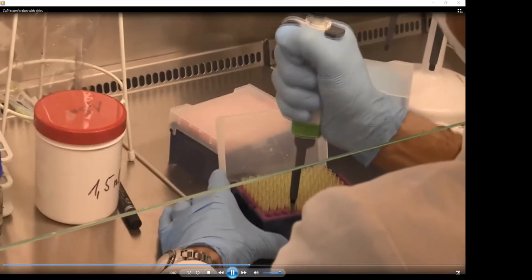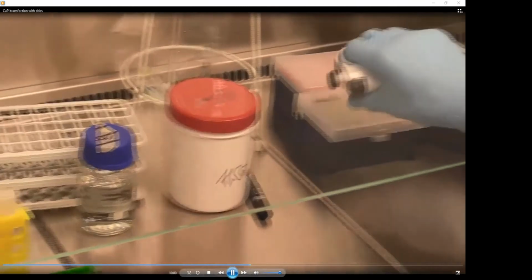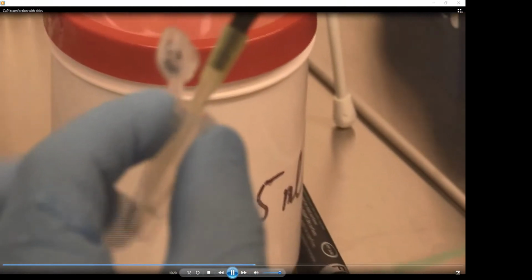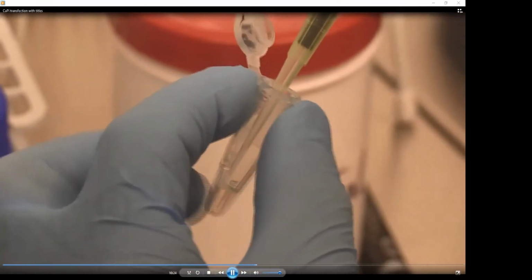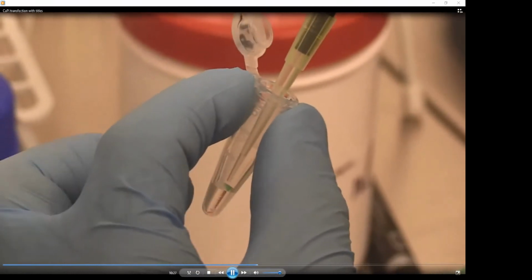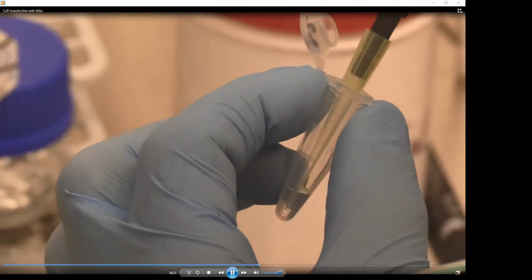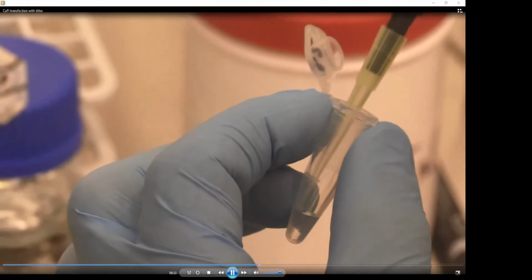Be careful, the volume of the calcium chloride depends on the amount of DNA. So in this case, we have a lower amount of DNA. That's the reason why we are using less calcium chloride, not as in the first sample. Once again, it has to be added dropwise, mixed after each step, and at the end, pipetted up and down 5 times.